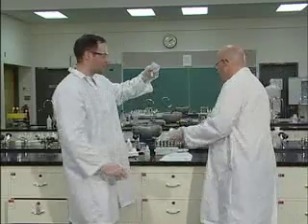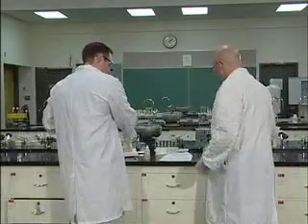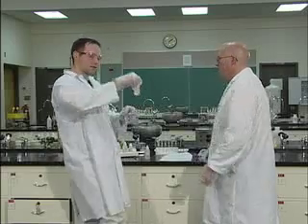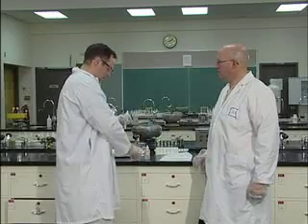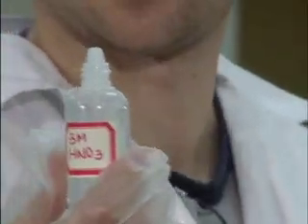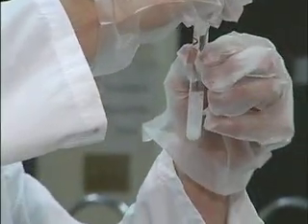Now, after we've added the barium nitrate, using the same tube, you don't change tubes, you're going to add nitric acid. Nitric acid is one of the nastiest substances in the world. It's not very user-friendly. Please be very careful with it. HNO3, you'll notice that they're brand new bottles. This is because each semester they eat through the bottles each time. So just be careful with it. We're going to add 15 drops of nitric acid.